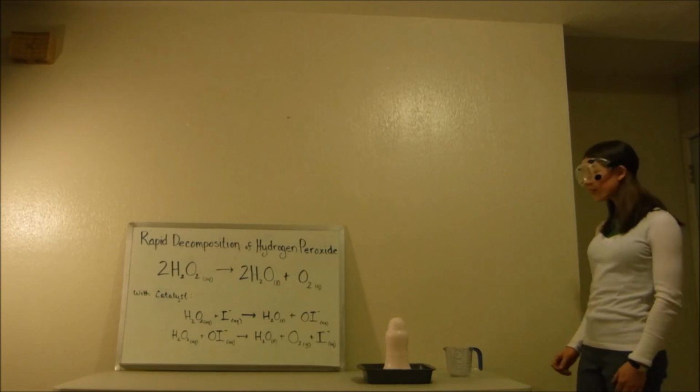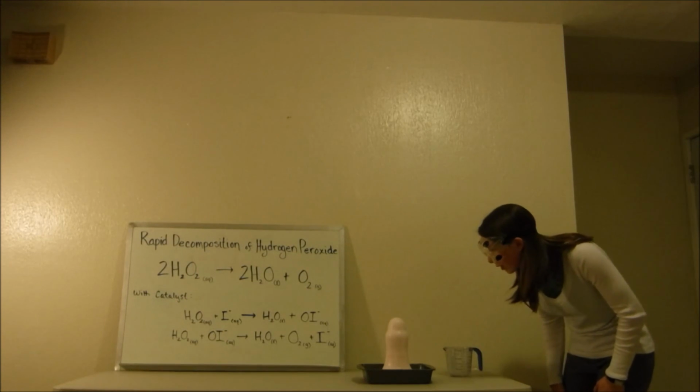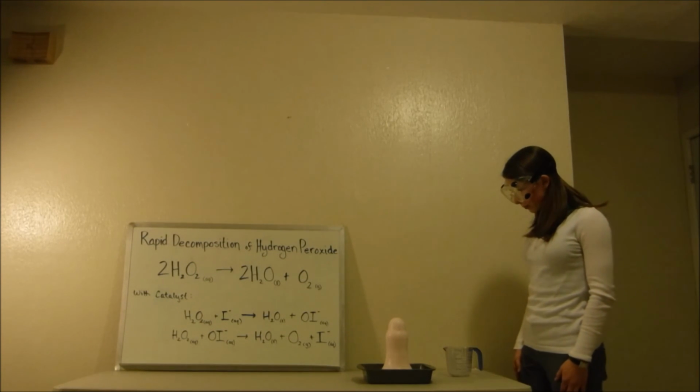Alright, so we can see this lovely fountain of pink bubbles, and the reaction is still running. But here we have it.